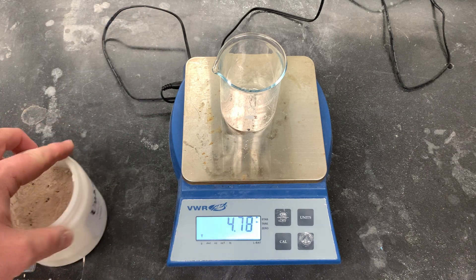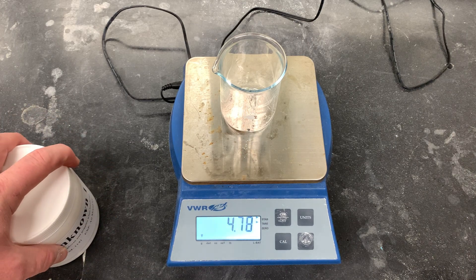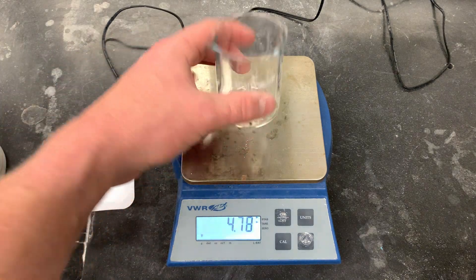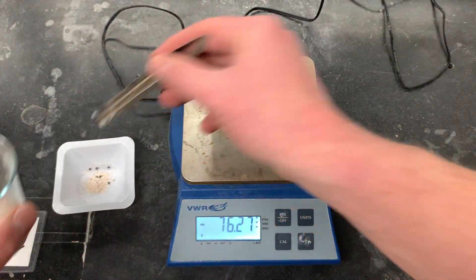As you can see, I got 4.78, which is a little bit more than I need. So what I am going to do is collect the excess here in a weighboat nearby. It doesn't take a whole lot to get it to a large mass — I'm going to put that into a weighboat.